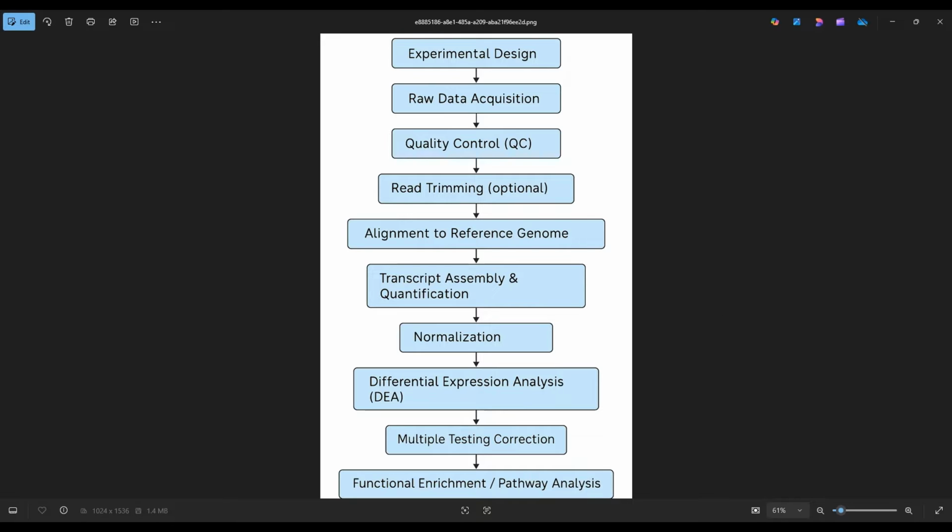So obviously, when you are working with sequencing data, RNA sequencing data, whenever you do that, you have some experimental design. That experimental design can be on plant genomes, bacterial genomes, human genomes or disease genomes. For example, the most commonly used is cancer genomic analysis, and in cancer genomic data, or any rare disorder data, you have two groups: one is the diseased group, and the other is the control group.